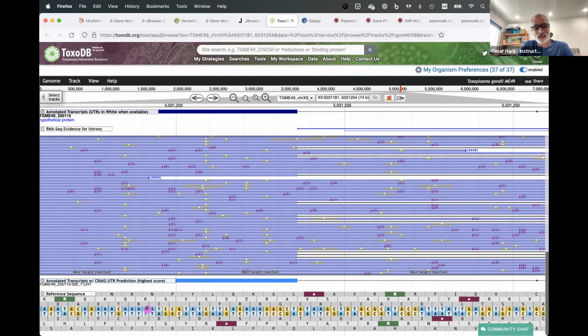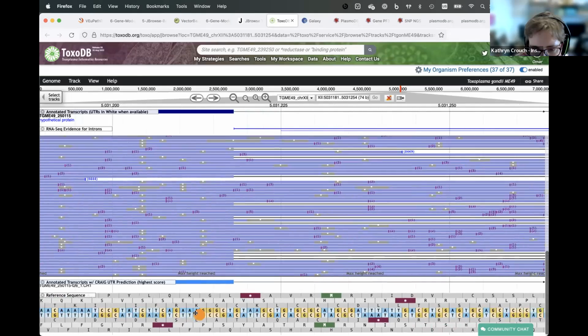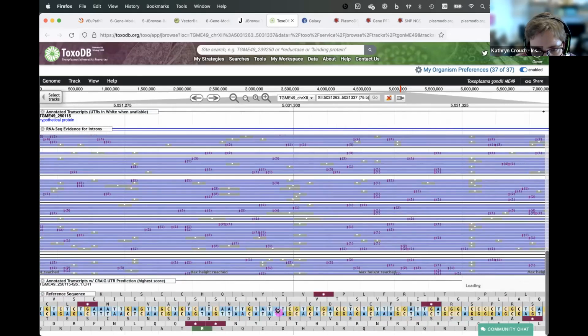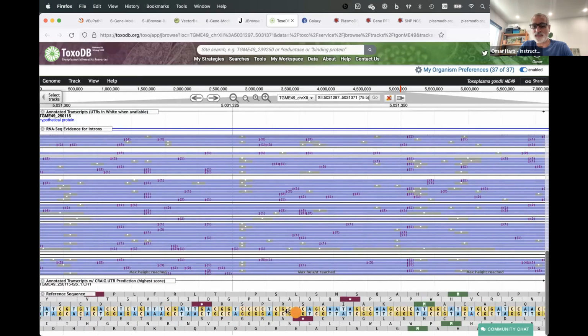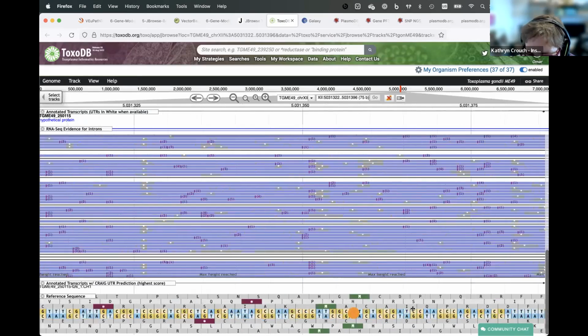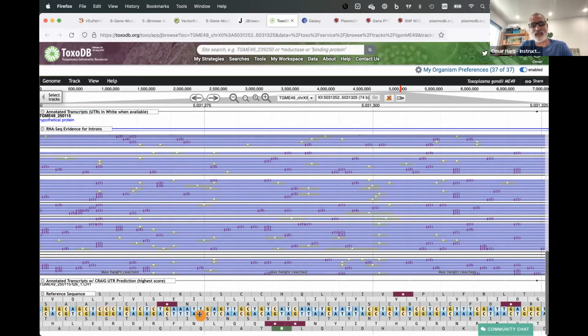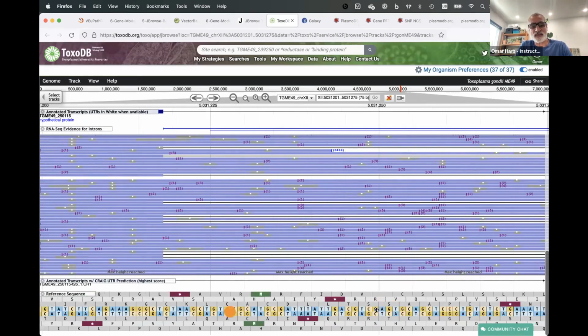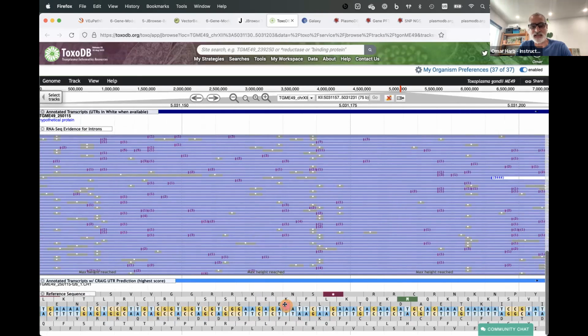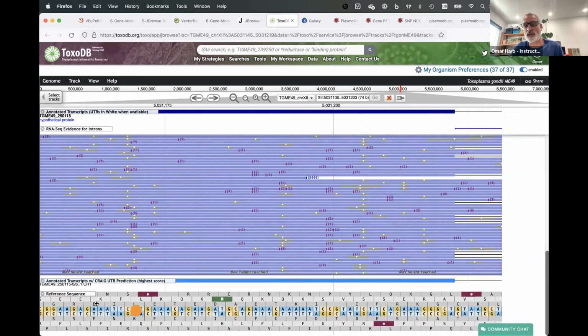I guess I don't know how long of a poly A track you need. I also can't see exactly where those transcripts are starting. But obviously, what Catherine is highlighting is an important aspect here. I can see there are lots of A's and T's here, so it's possible that this is just a highly AT-rich region that is doing exactly what you said.